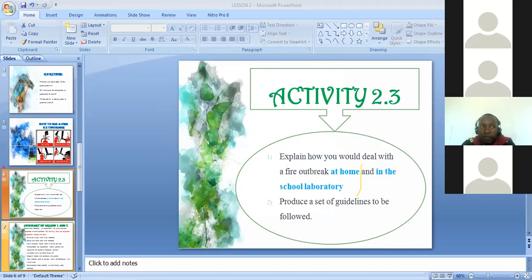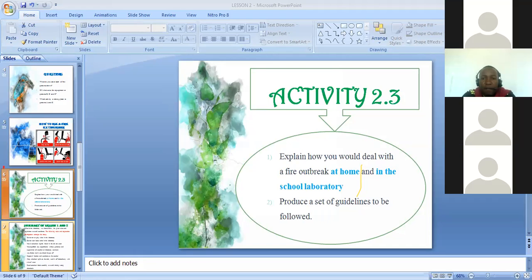In case of home usage. But to improve this one, water can be bombarded with carbon dioxide. Okay, so those fire extinguishing cars you see, they have carbonated water impregnated with carbon dioxide. Okay, as we are yet to see in the future.